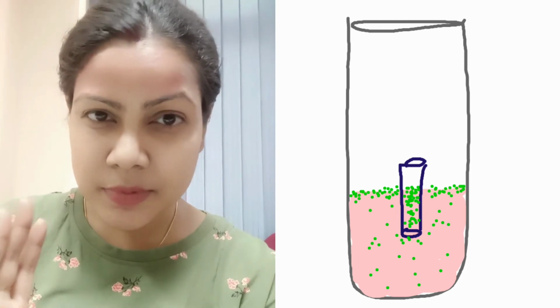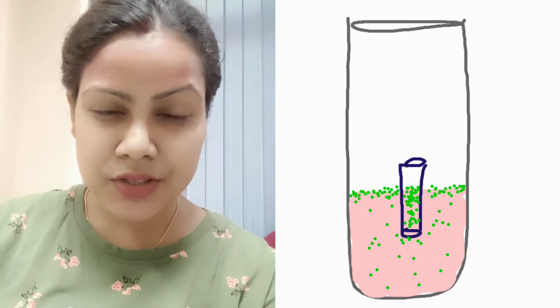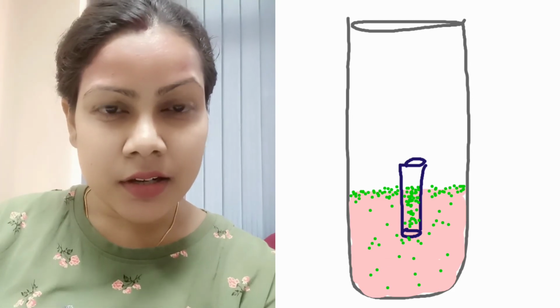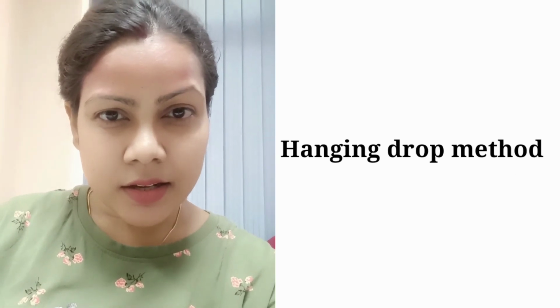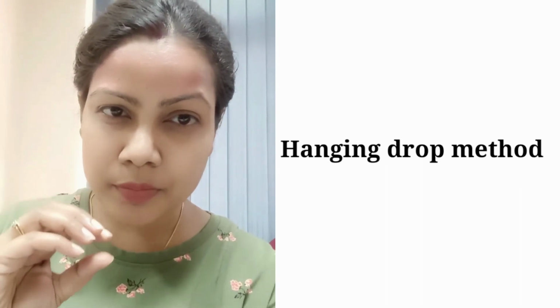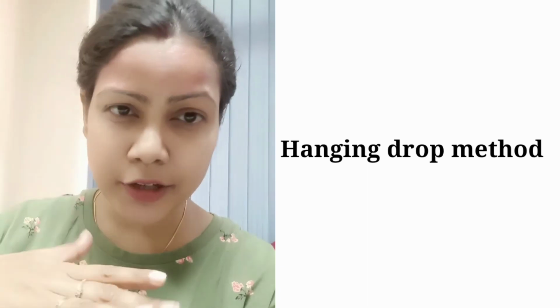Okay, now next indirect method of bacterial motility detection, that is, the detection of flagella, is the hanging drop method. What will we do in this method? As the name indicates, the drop will be hanging, hanging drop method.